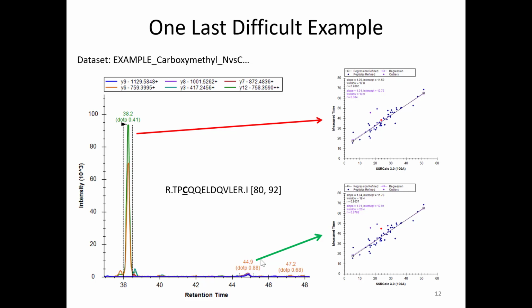I've always been the person that looks at the data, and this is where I try to use these kinds of plots where I'll only focus on outliers first of all, so it minimizes the need to do all this kind of work. But as far as moving that flag from one peak, it's reasonably straightforward in Skyline. We can show you shortcuts of zooming in and zooming out, and if you hover over here, it turns into a hand, so you don't have to integrate. Skyline will see a peak, especially if it's labeled, and you just click that, and it integrates it.